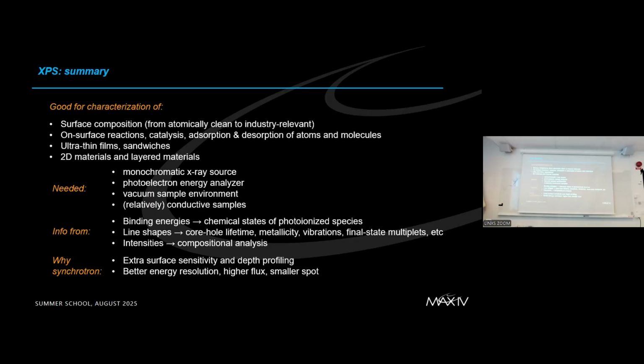For secondary electrons, it's a little bit larger. That means that the technique is really sensitive to the surface. You cannot bring any sample from the pocket and start studying it because most likely your surface will be contaminated. So what you will see is first of all the contaminations. That's why it's not good for everything, but it also doesn't mean that the standard samples cannot be studied.